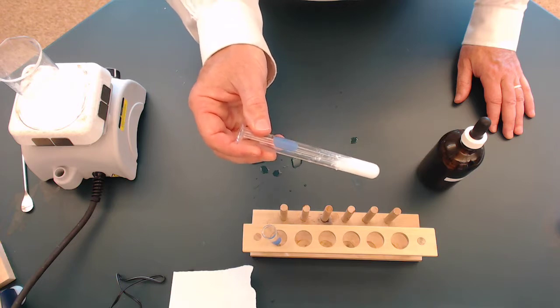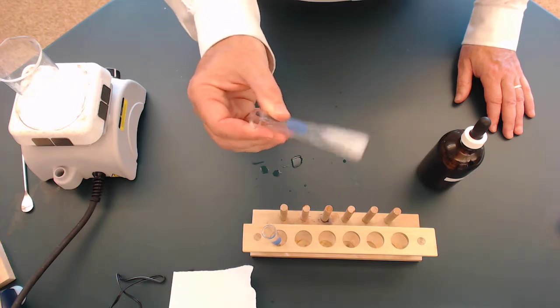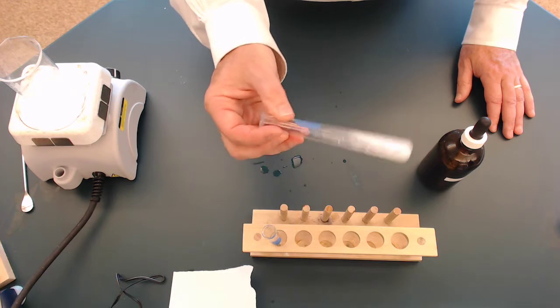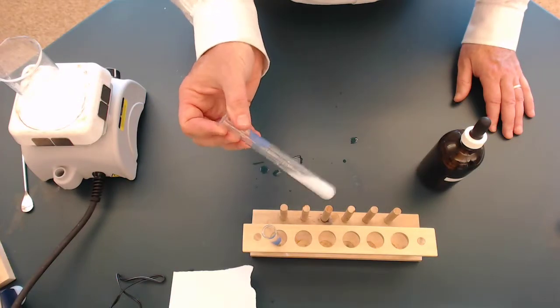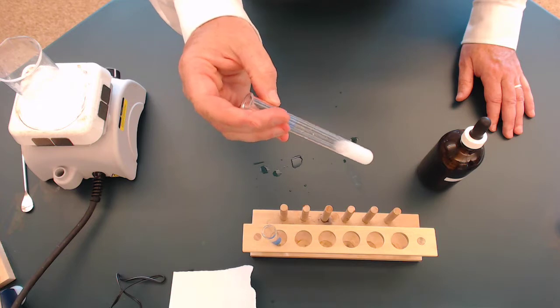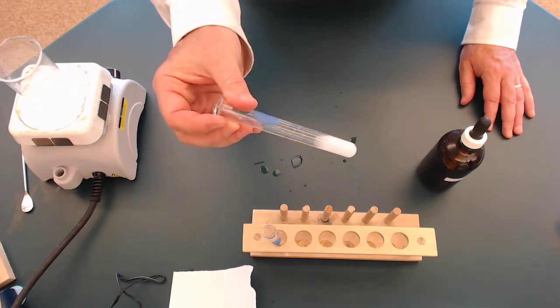You can see kind of a white powdery substance is formed, and if we keep mixing it up, you can really see the powdery substance is getting on the sides. And in the bottom, it's kind of hard to see on the tape, but there's actually a solid forming in the bottom. So what you need to determine is whether that's a chemical or physical change. We actually have a name for that solid. That solid is called a precipitate.